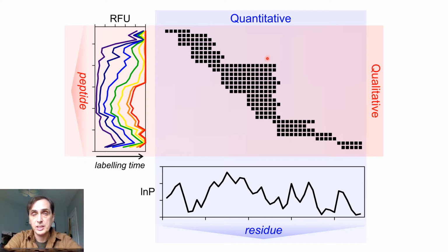Now HDXmodeller is actually a tool for high resolution HDXMS, and I should add that when I say high resolution, I'm not referring to increasing the spatial resolution of the data. This can be achieved using better digestion or some data averaging tools.